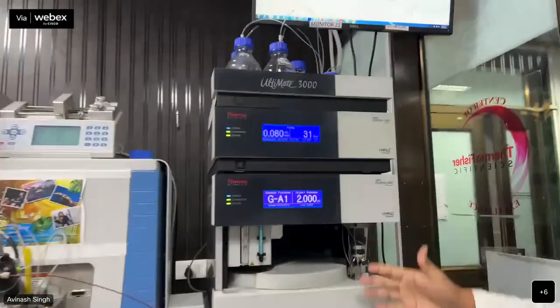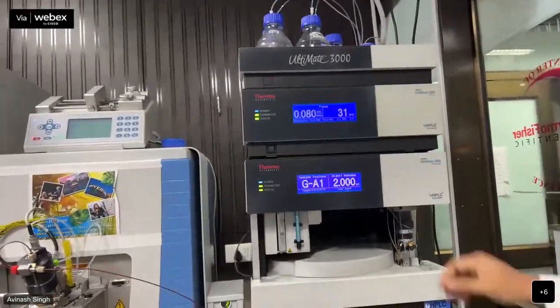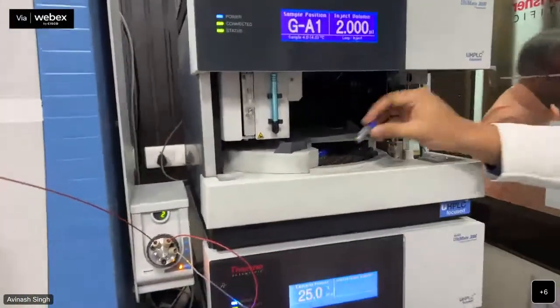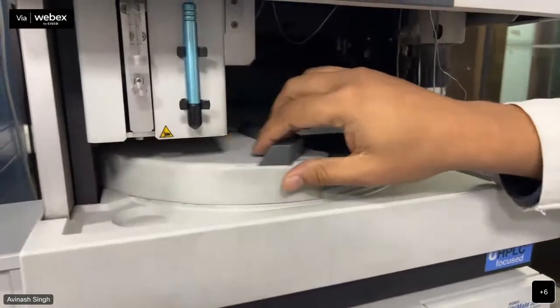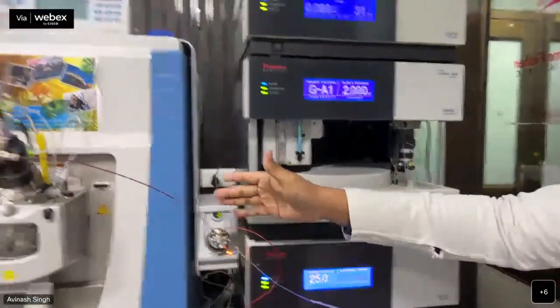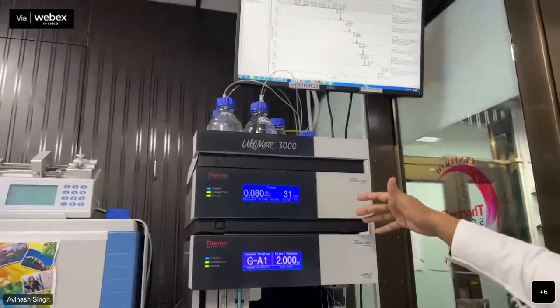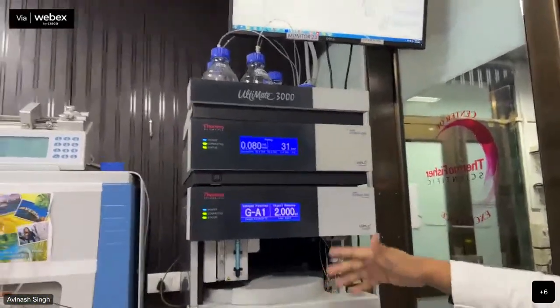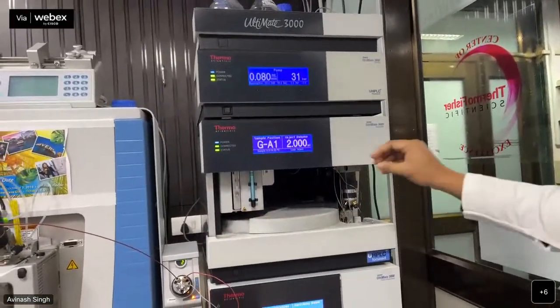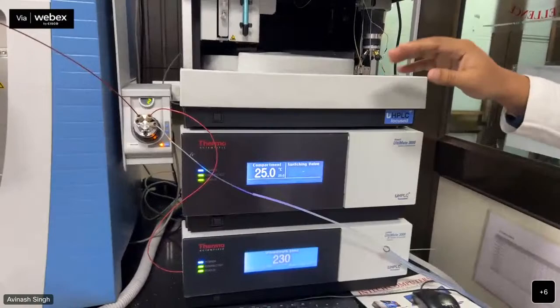So this is the UHPLC. Here we are taking our sample. This unit has different compartments. This is the sample compartment, where we keep our samples in different areas. After that, these samples go through different tubings to the mass spec for analysis. This HPLC has different units, like a pump, which helps in transporting the solvent and the samples to the mass spec. And this is the autosampler where we keep our samples. And this is the column compartment, which holds the columns through which the samples pass.